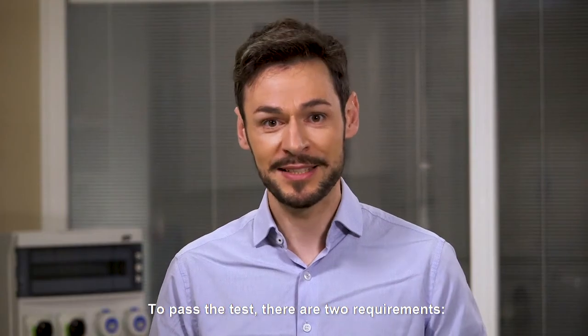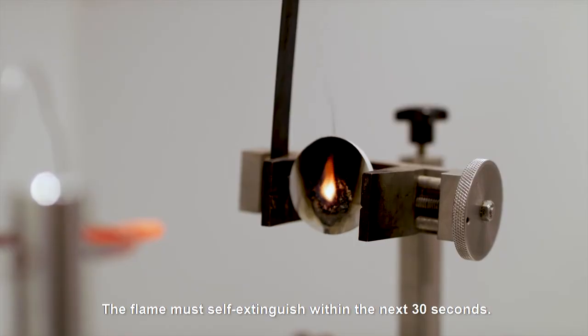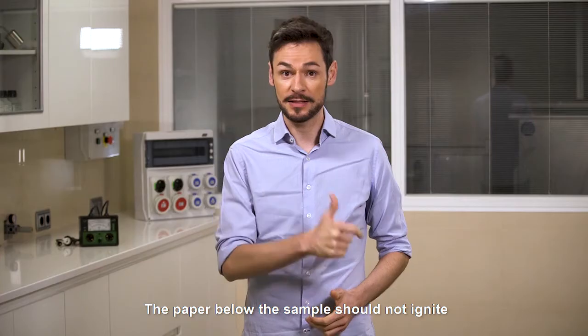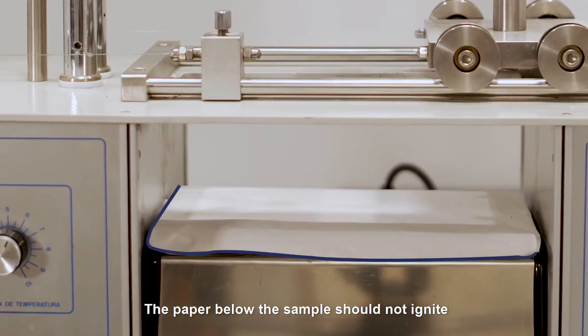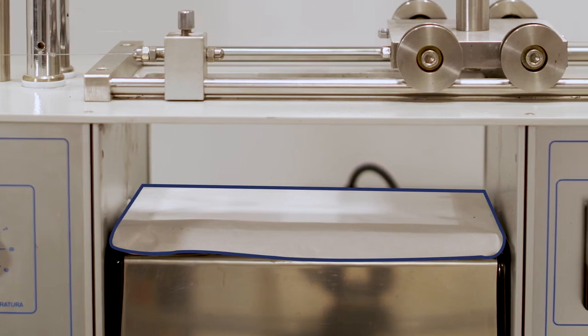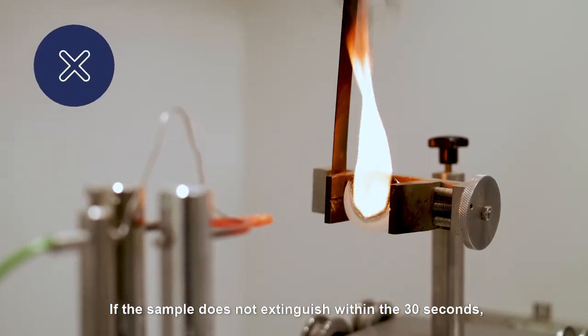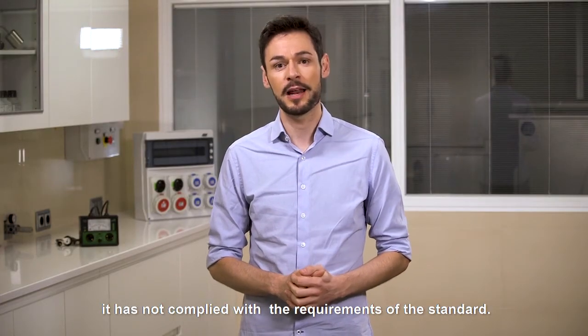To pass the test, there are two requirements. The flame must self-extinguish within the next 30 seconds. And second, the paper below the sample should not ignite, if there is any dripping of the plastic material. If the sample does not extinguish within the 30 seconds, it has not complied with the requirements of the standard.